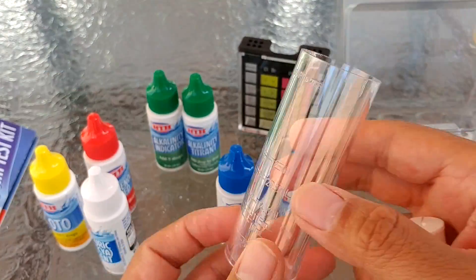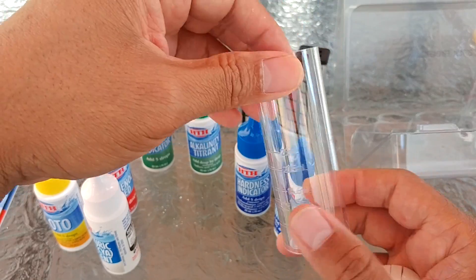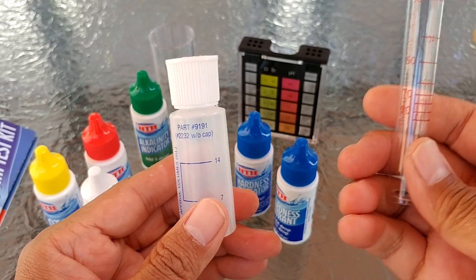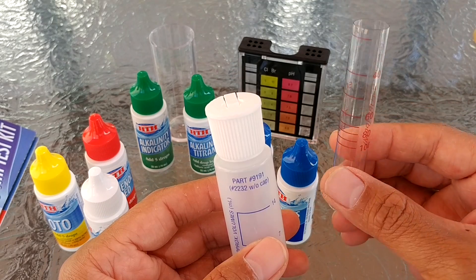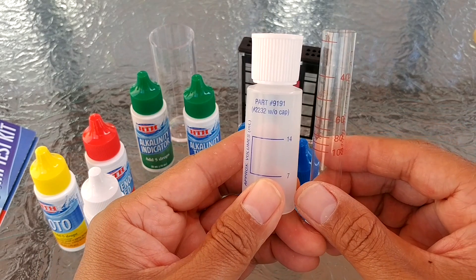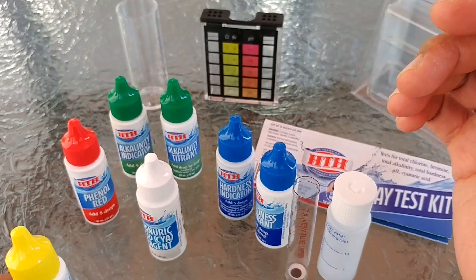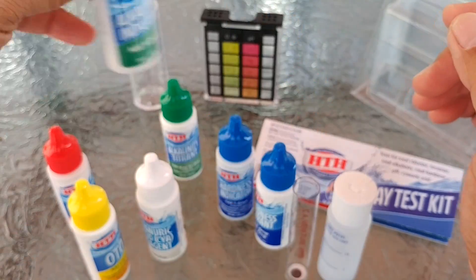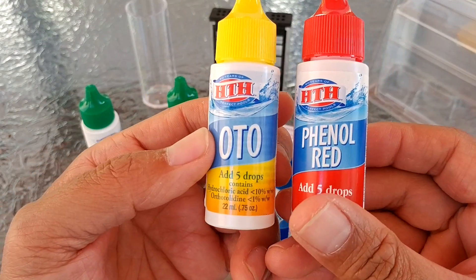You also have this container to test your chlorine and/or bromine and your pH, and you have this vial to test for your alkalinity and your hardness. Then it comes with this container plus this test tube, and if you look at the test tube it has a black dot in it — that's how you will measure your cyanuric acid. Each bottle comes with 22 ml of liquid reagent.